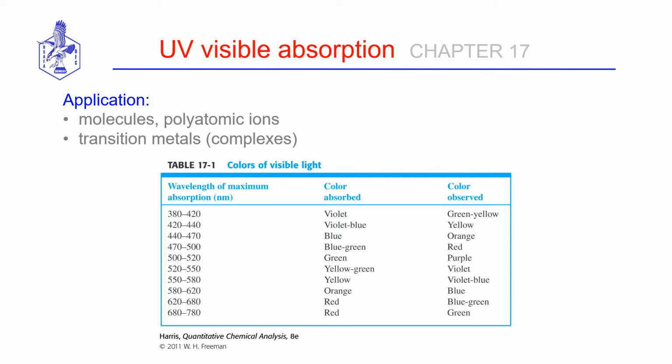In terms of wavelengths in nanometers, as we come down this list, we are increasing the wavelength of the light.